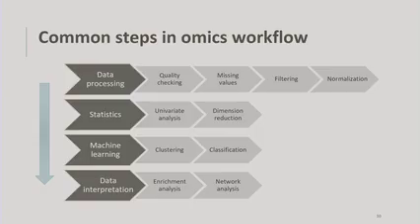What's the quality, distribution? Do some t-test, ANOVA, and do some simple things to understand it thoroughly before you do anything more advanced. This is very, very critical: use simple, effective, robust methods to understand your data first before you apply any advanced ones. One thing I usually don't like is when people with little biological or medical background, just purely computer science or machine learning, apply every fancy tool on their data and then talk about exciting discoveries, which is very dangerous. So we need to understand the data with simple, effective methods first before we try other methods.